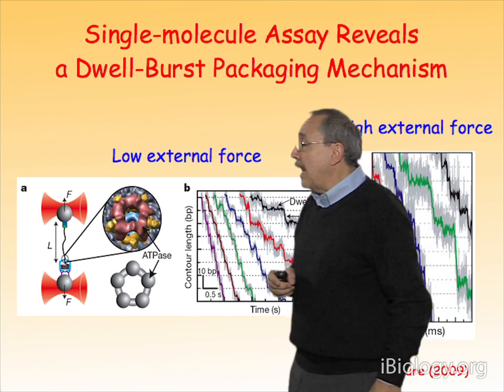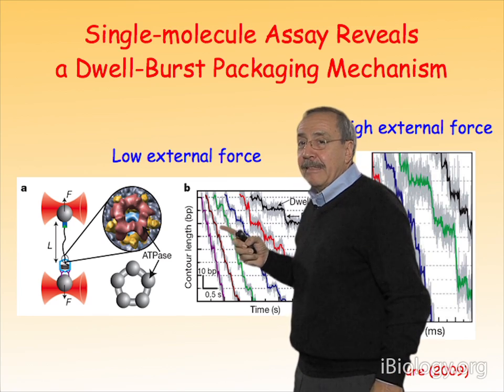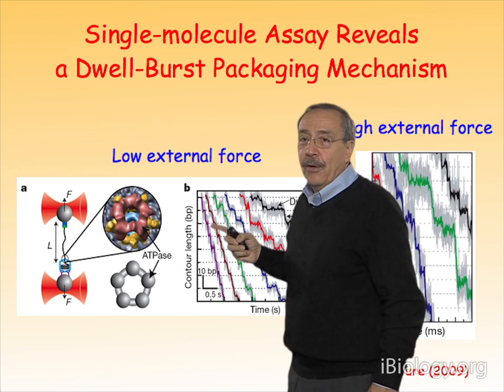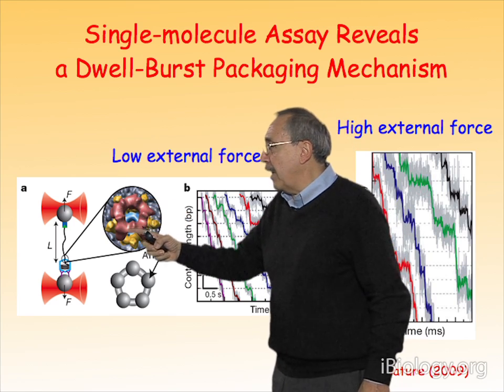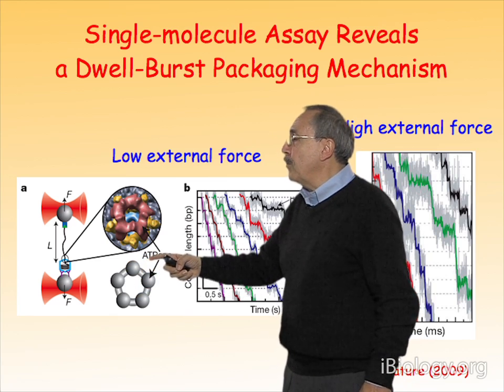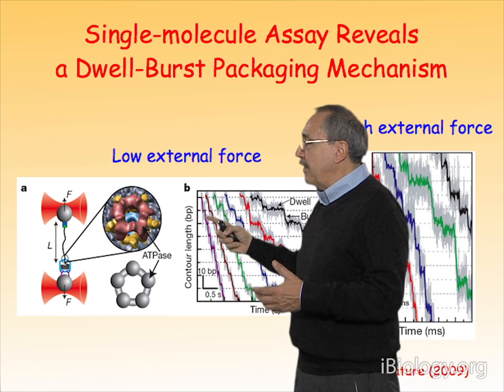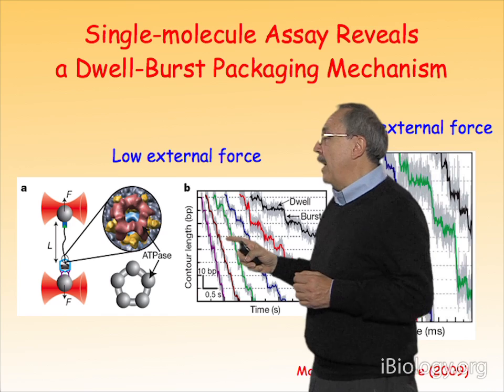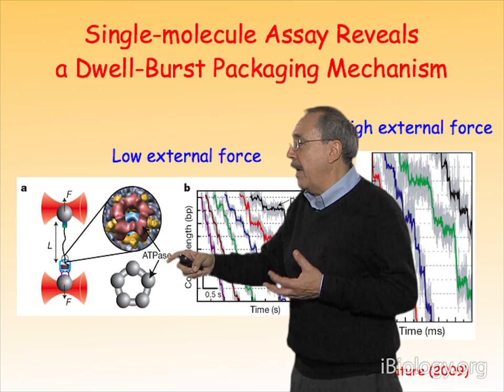Okay? Now, it turns out that 10 base pairs is not the minimal step size of the motor. This 10 base pairs is made up of sub-steps of the individual ATPases in the ring. The motor has 5 ATPases, as shown here. And so what we are seeing, presumably, is the result of all of these ATPases making 10 base pairs in one round cycle for the whole ring. But now you may want to ask, what is the displacement caused by one ATPase at a time?